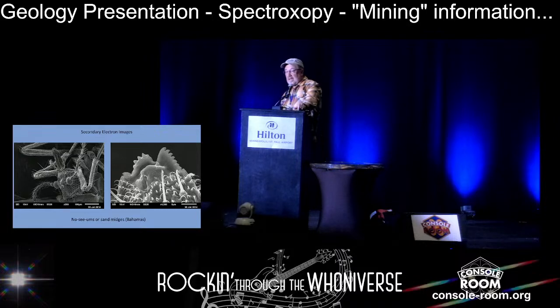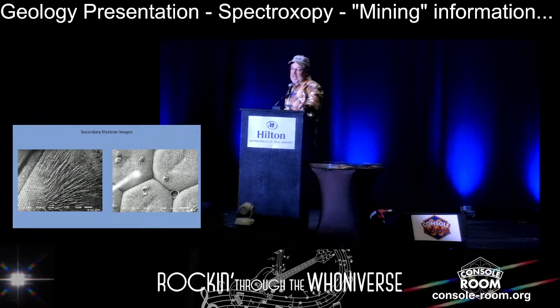Another image that I loved was a dead butterfly that was found in my folks' cabin. Brought it back, and you could see the hair on the eyeballs, which was really cool. They have compound eyes, and zooming in on that, you could see the nature of the individual lenses. Then you can zoom even farther and see structure within each individual lens.